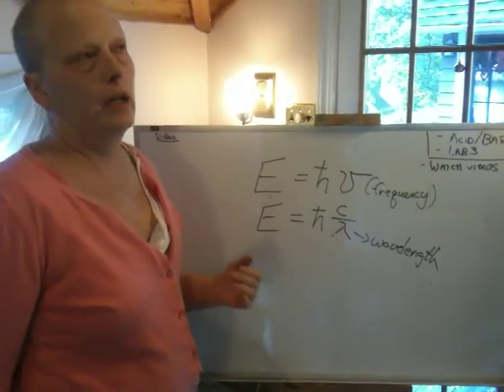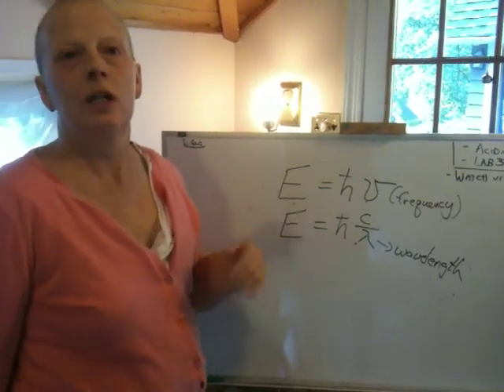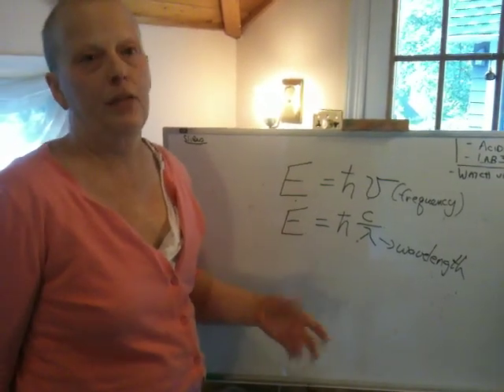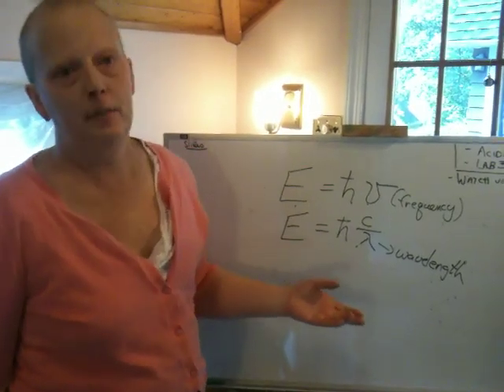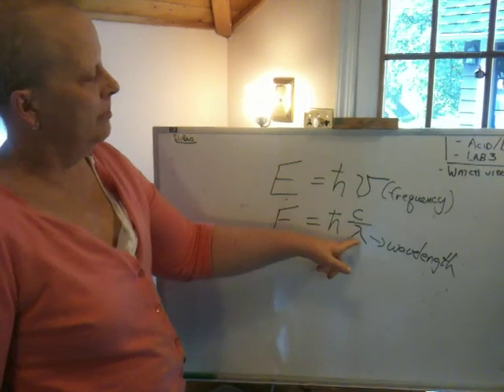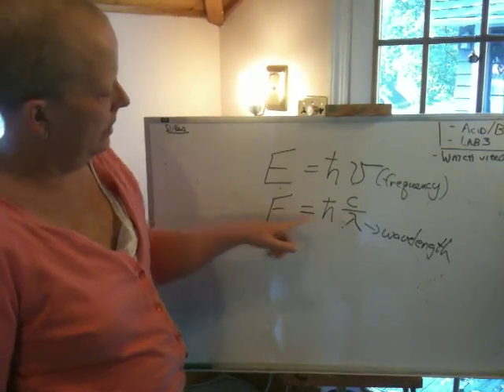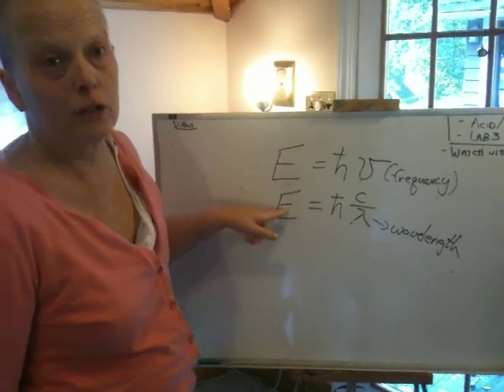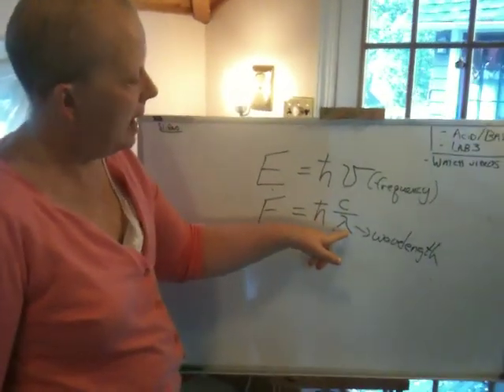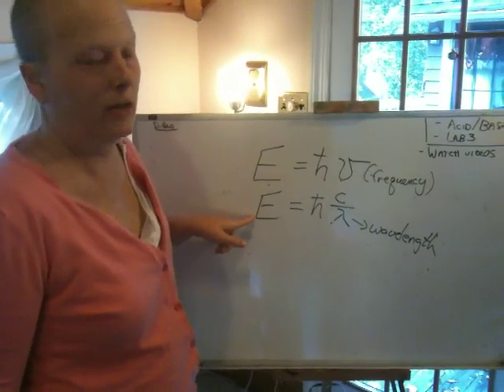So when you were doing Spec 20 work or UV-visible work, you would talk about setting the wavelength at, say, 550 nanometers or 600 nanometers. That's in the visible range. And in that case, what this is saying is that wavelength is inversely proportional to energy. So when you were at higher wavelength, you were actually at lower energy, okay?